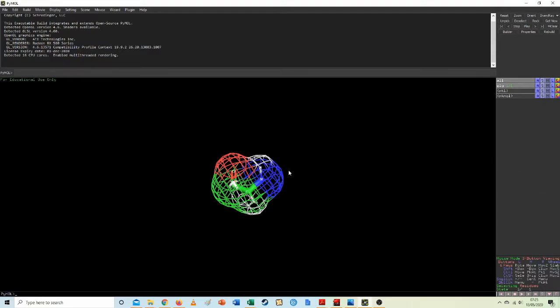There we go. There's a little different way to look at it. Now, this is pretty interesting because what you're really looking at here is the inner lines that we've got. Those are really where the atoms are. However, the mesh really shows you where the electron cloud is.